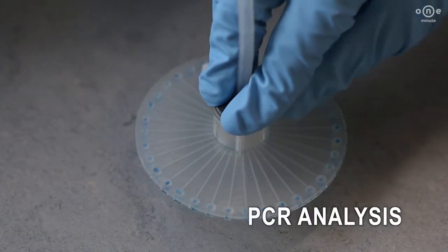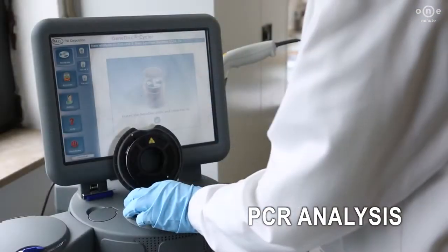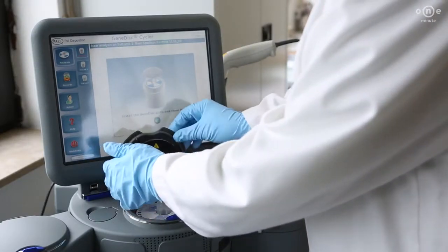Once the GeneDisc plate is filled, insert it into the cycler, close the lid, and the analysis will start automatically.